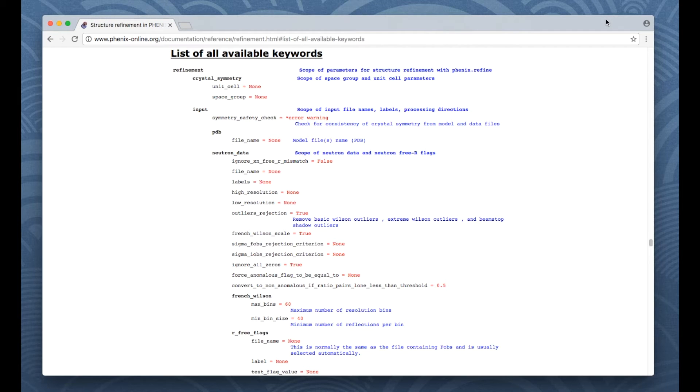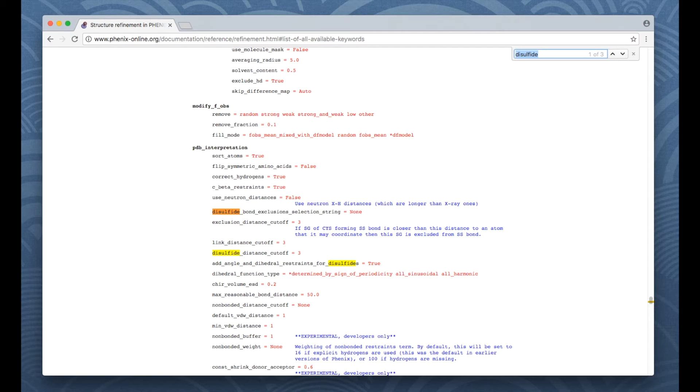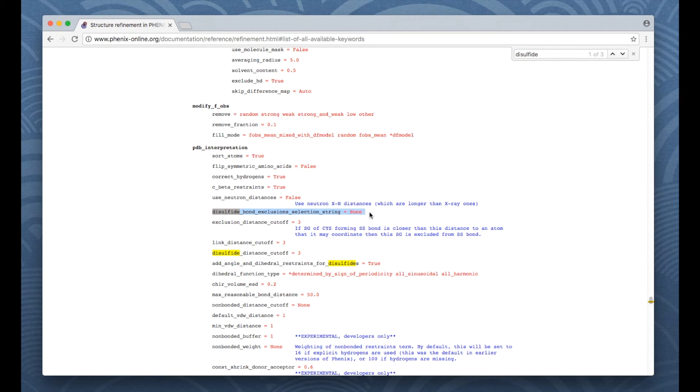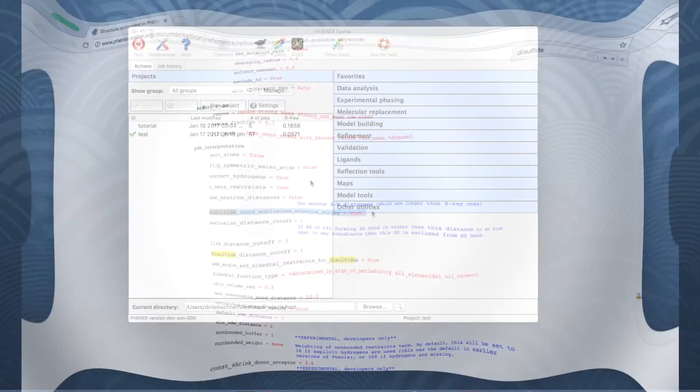Let's go back to the documentation and look for the name of the parameter. It is found under PDB interpretation and is called disulfide bond exclusions selection string. So where to find it in the graphical user interface of Phoenix Refine.